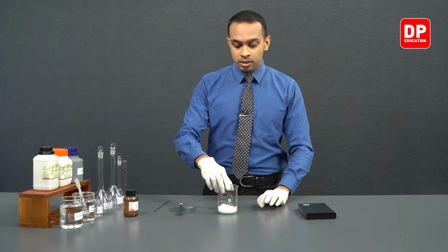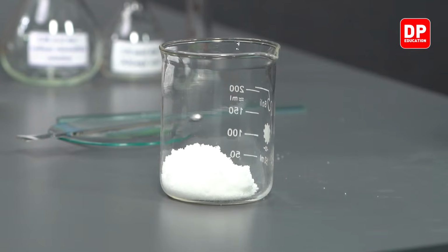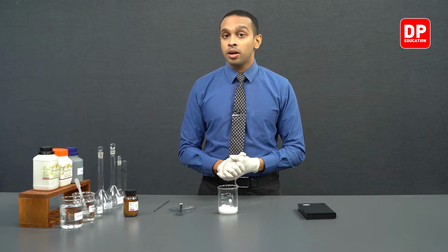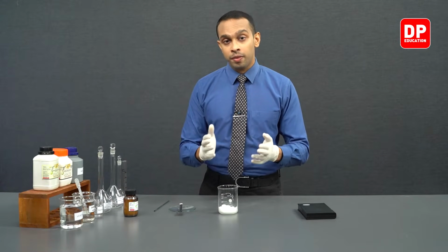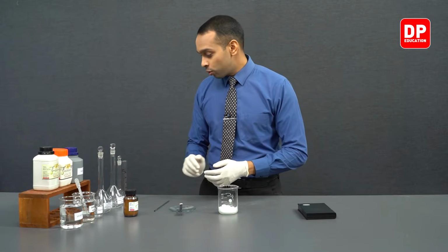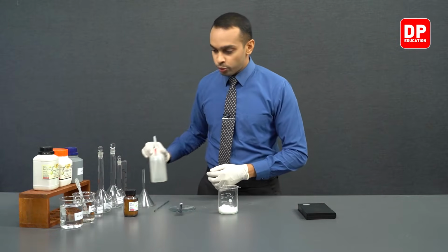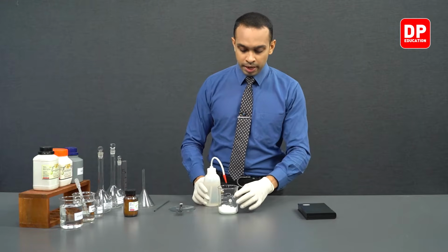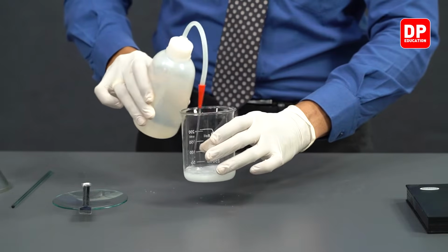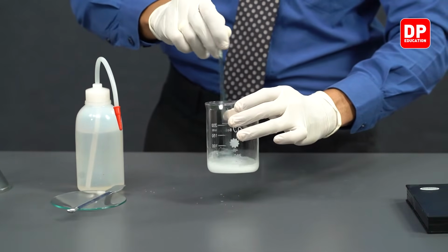Since transferring this whole amount of potassium iodide into a volumetric flask could be difficult, we are going to dissolve it with a little bit of distilled water first, and then transfer it into a volumetric flask. We have our funnel and the wash bottle here. We will add a small amount of water and try to dissolve as much of this potassium iodide as possible.